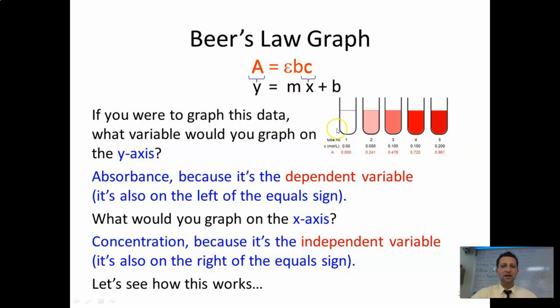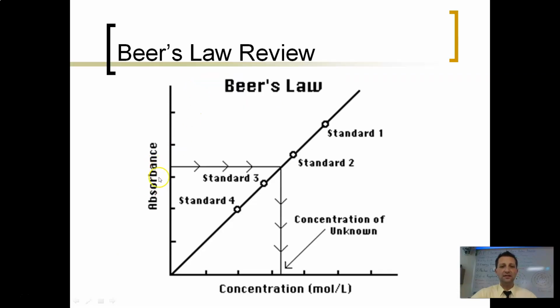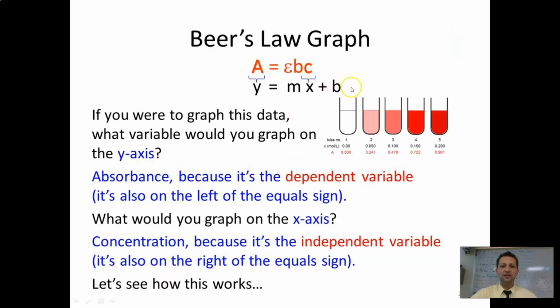So what you'll do is plot your data, and then you will take your absorbance value and pop it in here for y. Okay, because y is plotted here on the y-axis, or absorbance is here on the y-axis. All right. Your slope comes from your best fit line. Your x is your concentration because it's on the x-axis, and plus b. Now in the lab, you're going to have a little bit of error, so your y-intercept won't be exactly 0. Okay, it should be really, really close to 0 though, or else it'll really throw things off. Okay, so that's what this is summarizing here. Okay, and that's not what you need.